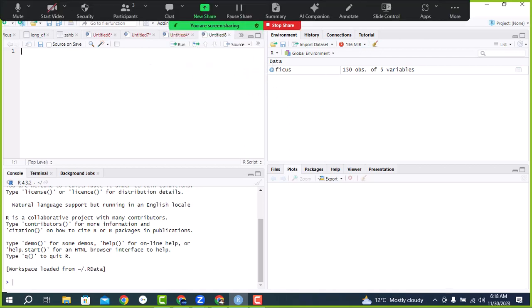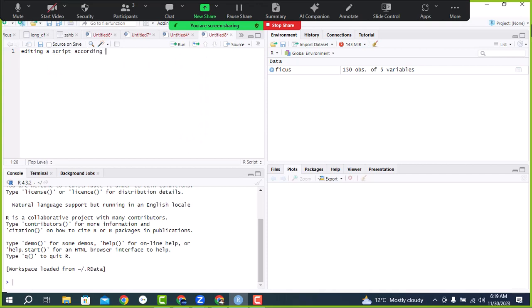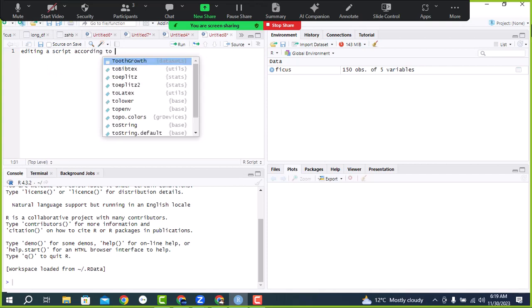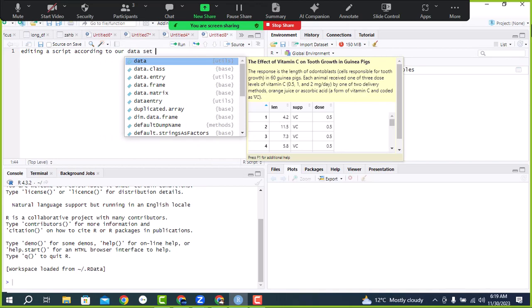Today our topic is editing — how we edit a script from a website, and editing a script according to our dataset.